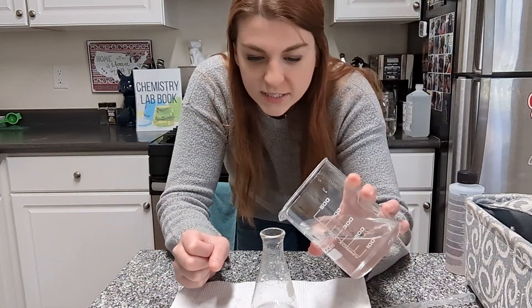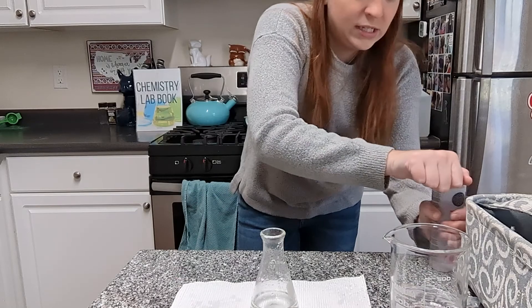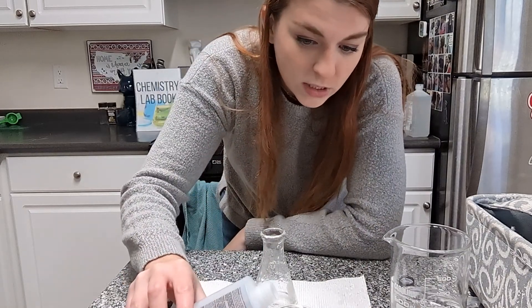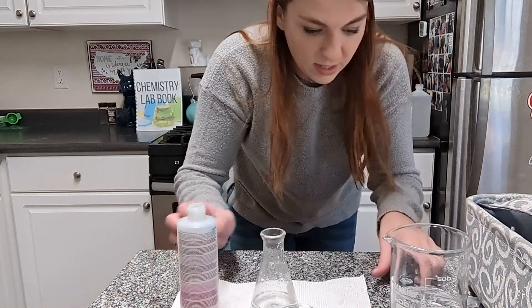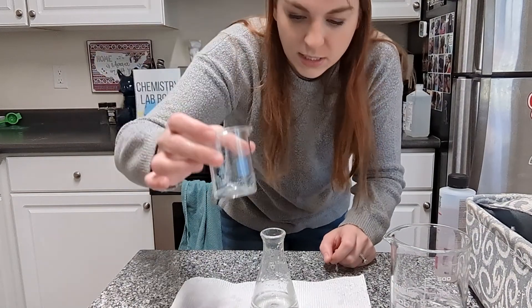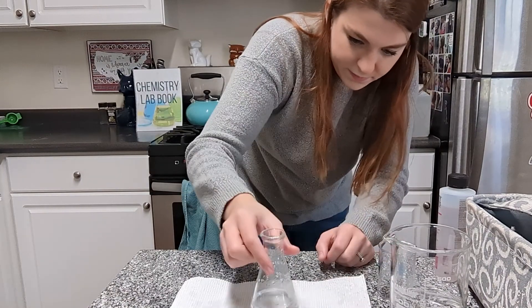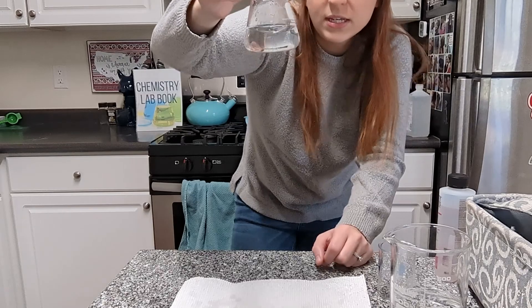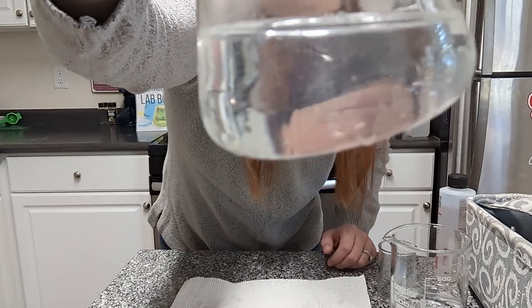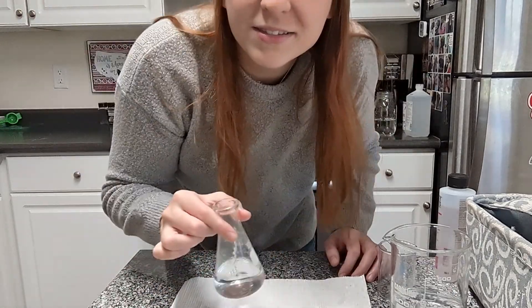Next up we are going to try some acetone, which is nail polish remover. This is pure acetone — 100% acetone will melt paint off of stuff and will melt a styrofoam cup, so be very careful with it. I'm just going to use a little bit here. Just like the alcohol, it's kind of mixing in — a little bit stringy. But there you have it: it makes no layers, no bubbles like we saw with the oil. So acetone is polar.